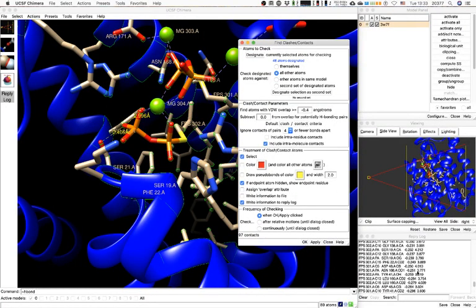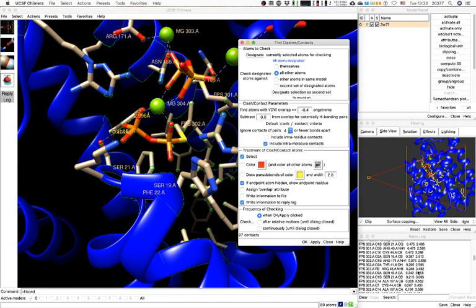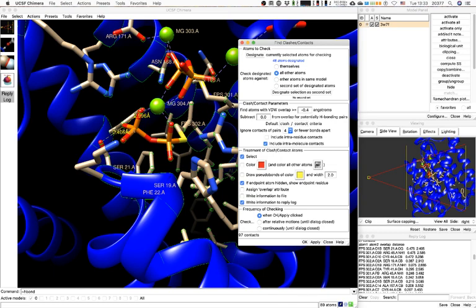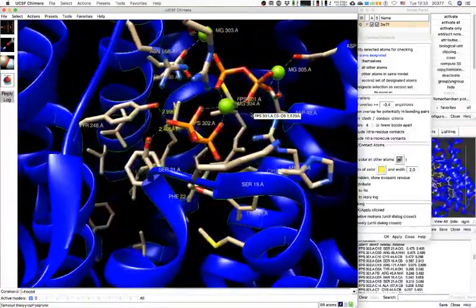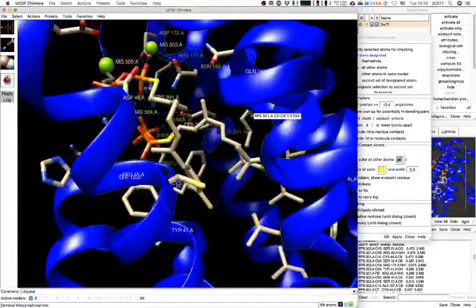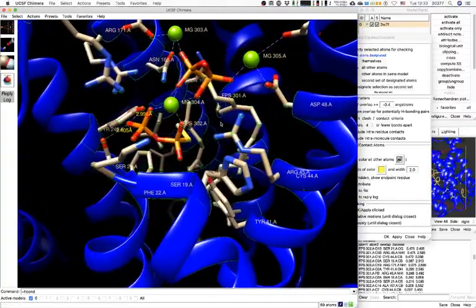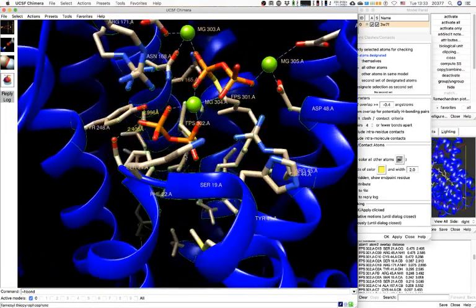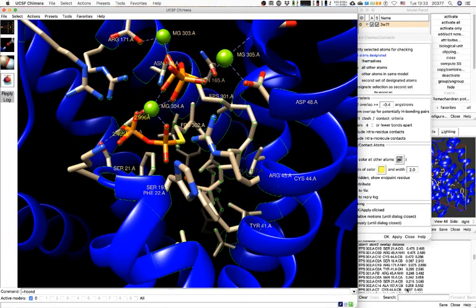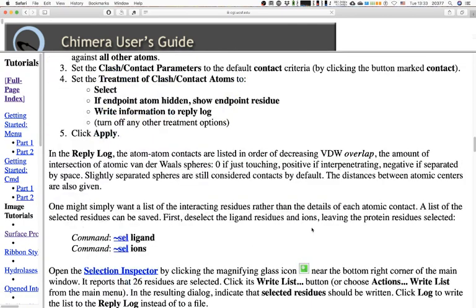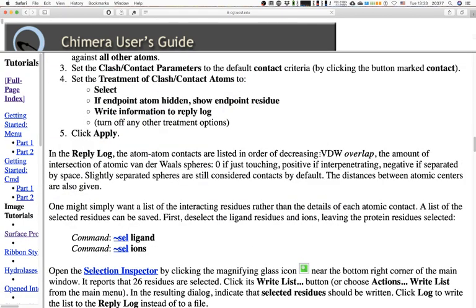We now see another list in the reply log with atoms, overlaps, and distances. On the main screen, many atoms are selected — the tips of side chains involved in these interactions. We can save these distances. There is a column with the van der Waals overlap: the amount of overlap if atoms were considered spheres. Slightly separated spheres are contacts by default. Zero means touching; positive numbers mean overlapping; negative means separated. We see some overlap values close to zero and a couple of negative values.